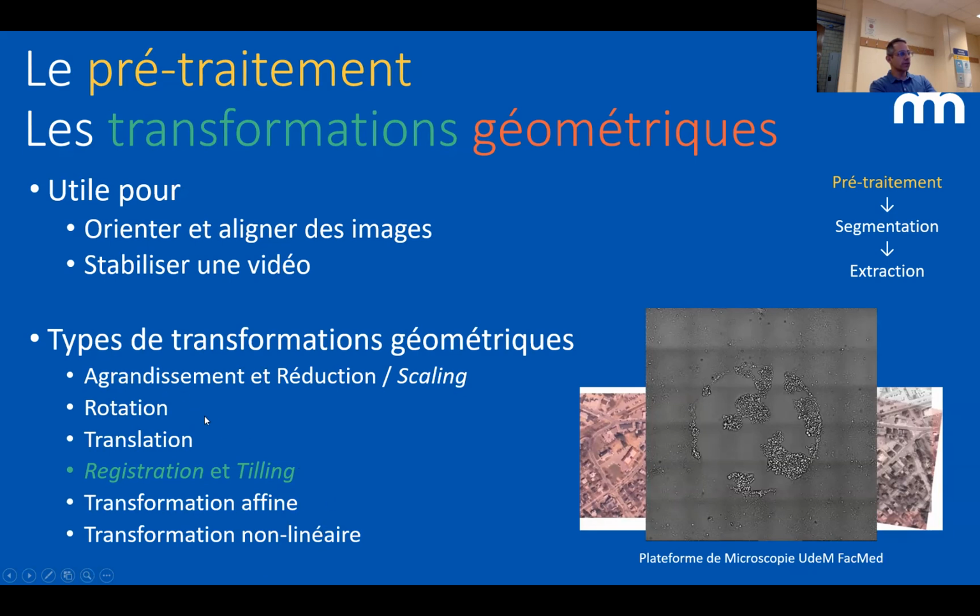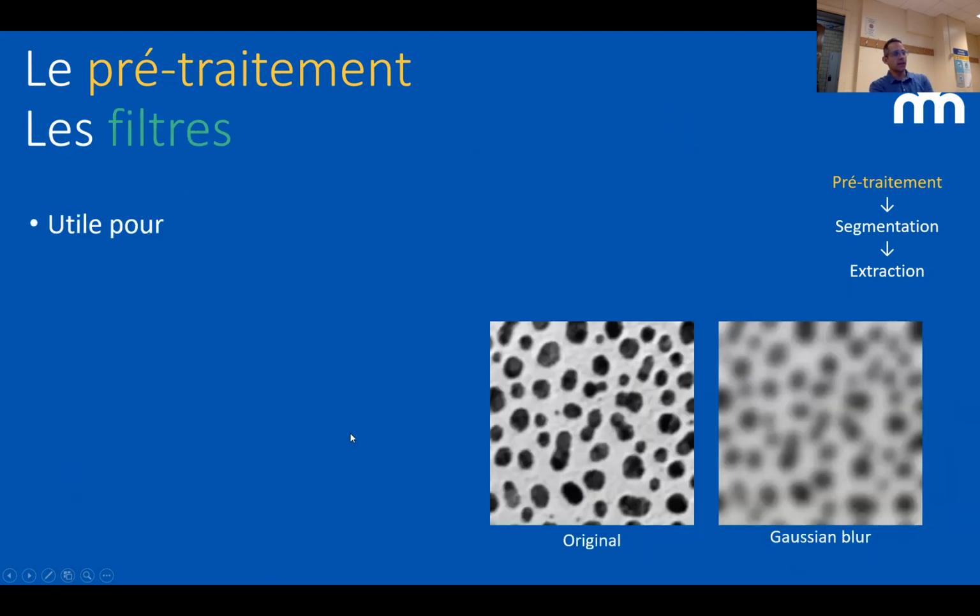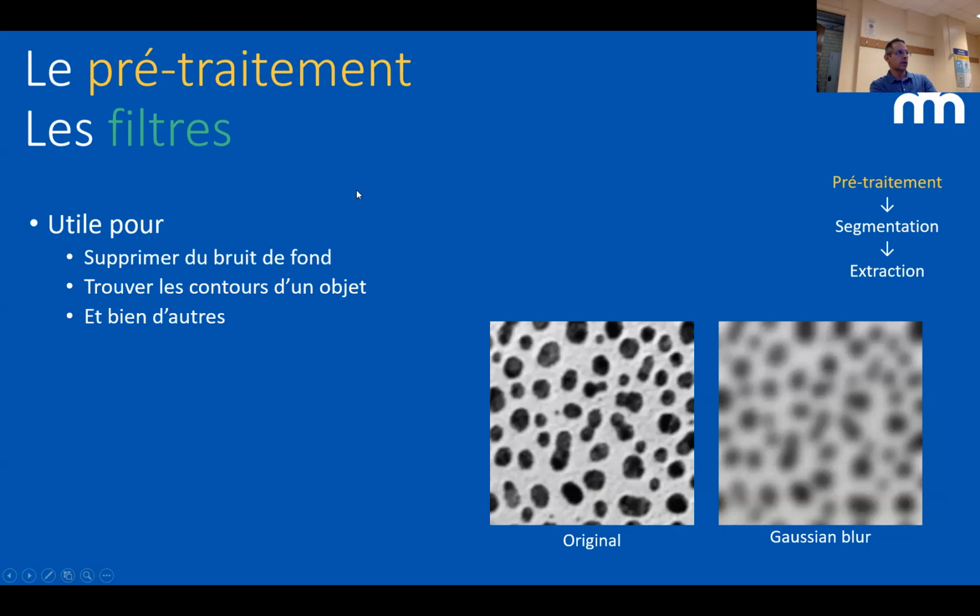There is different kind of transformation I didn't talk about. These ones are kind of fixed because you don't stretch your image, but you can also have things where you actually stretch part of your data. And this is useful for big tissue or brain images or things like that. In microscopy, we don't use it often, but it's something I wanted to show to you.